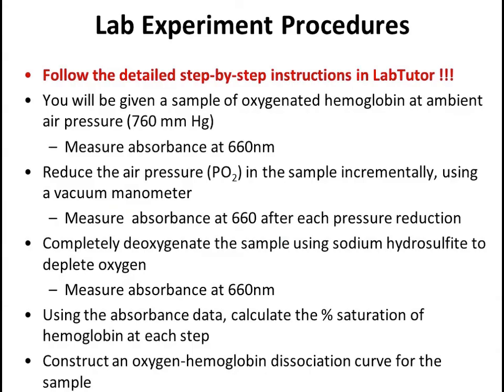Next, I want to briefly walk you through the experimental steps of how we're going to construct the oxygen-hemoglobin dissociation curve in the lab. Please note that I'm not going to go through every single detail of the procedure. Before the lab, you should read through the experiment in LabTutor, and during the lab, you should be sure to follow the detailed step-by-step instructions that are given by LabTutor.